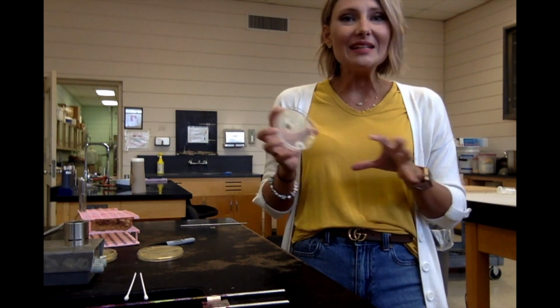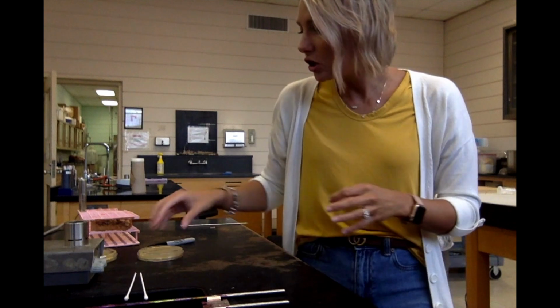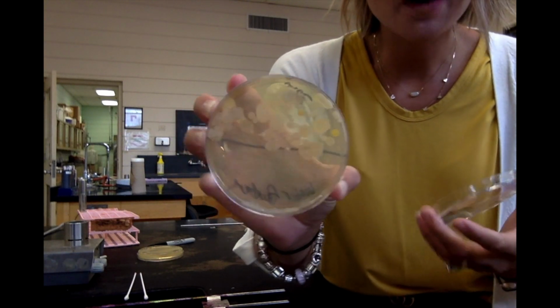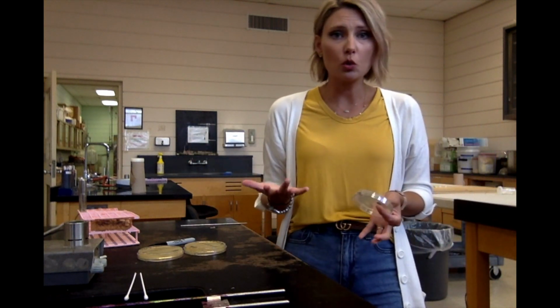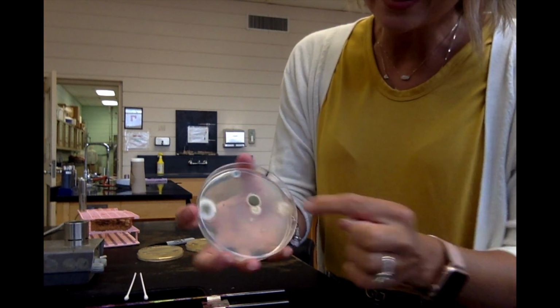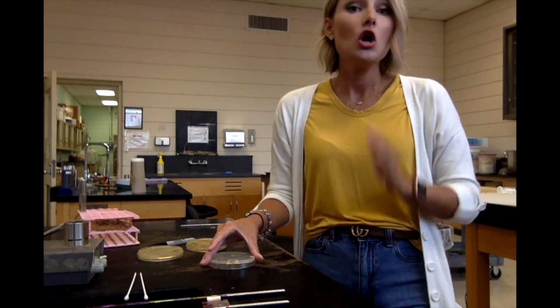So that's going to be the main difference between being able to tell the difference between a fungal colony and a bacterial colony. If we look back at our bacterial colonies, you'll see that they're not really that raised, and there's not those hairy, fuzzy projections coming up off of them. So if you were in the lab and you had an unknown that you were working with, and say all the bacterial colonies looked like these that were on the water fountain, and then all of a sudden you got something like this that was growing on your plate, you then clearly know that that is not your bacteria. You've got some kind of contamination, and you need to address that. You need to do another streak plate, try to get it pure again.